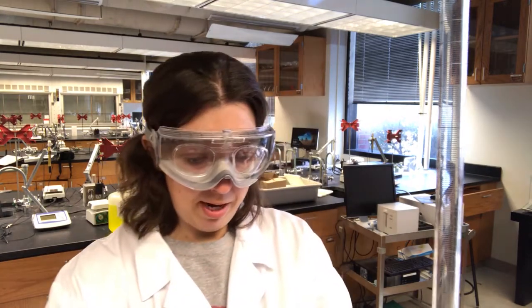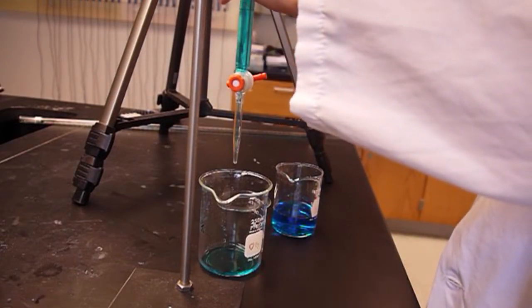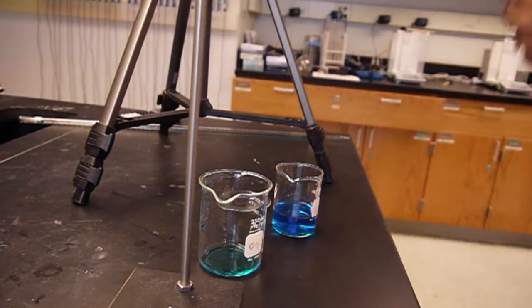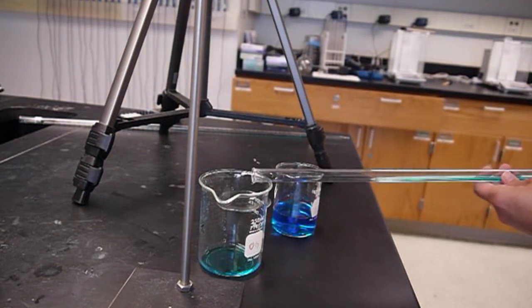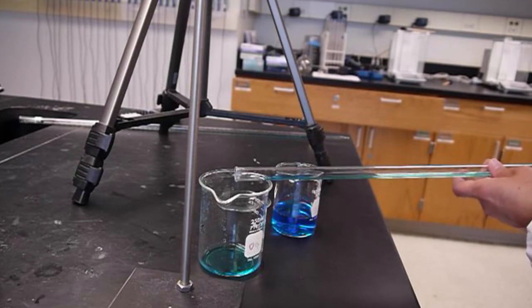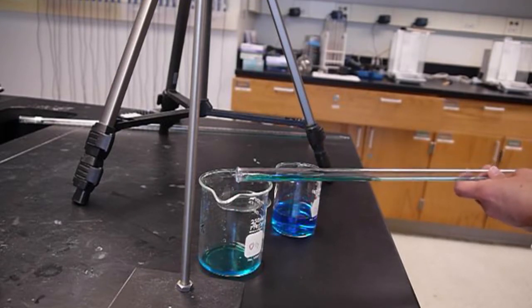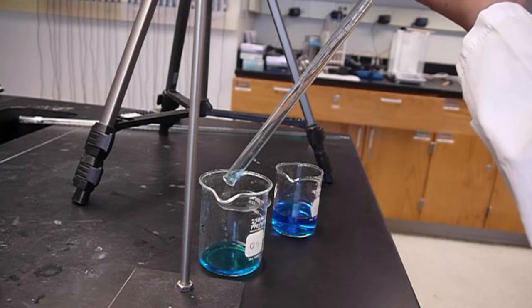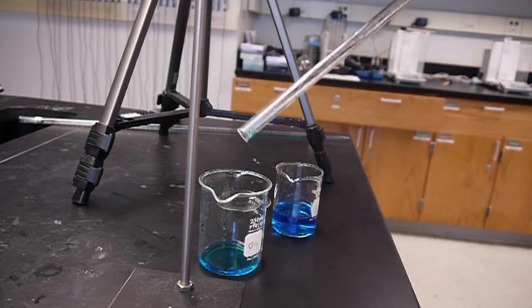Okay, so I filled up my Buret just a little bit, and I'm going to open up the stopcock and drain a little bit of the solution. The other thing that I'm going to do is tip the Buret with the stopcock closed and into a waste container, and I'm going to let the solution sort of wash over the walls of the Buret, and I'm rotating the Buret as well, and eventually we're going to just drain all of the solution out. But that's a great way of cleaning, making sure you're cleaning every part of the inside of that Buret. Okay? So we'll drain that.